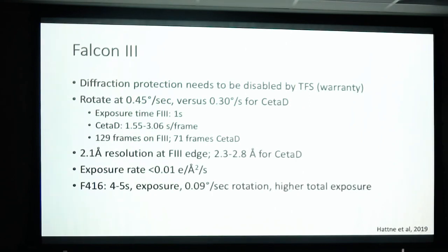There was a paper just last year where they used a direct detector, a Falcon 3, to collect diffraction images. So that's a bit challenging. First of all, you have to convince whoever has the microscope to let you do that, which would be very hard, I think. But the camera itself also has all of these software protections in it, so it won't normally let you take a picture in diffraction mode. The software just locks you out. So they had to get Thermo Fisher to disable the diffraction protection for that camera, which I'm pretty sure invalidated their warranty. I'm sure if they burnt a hole in it, that'd be it for it. But it was actually a pretty good detector for this sort of thing.